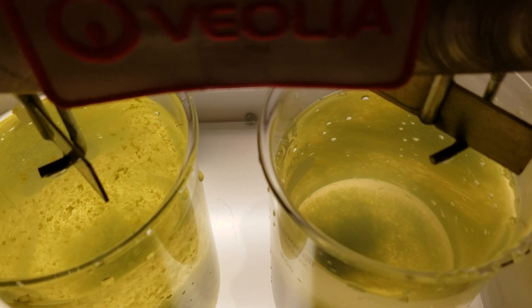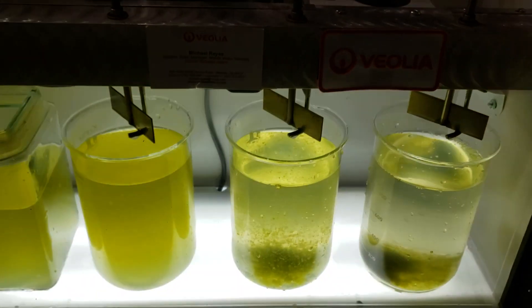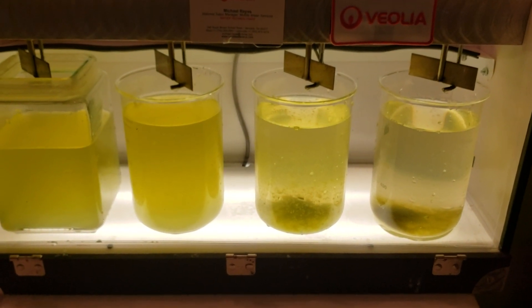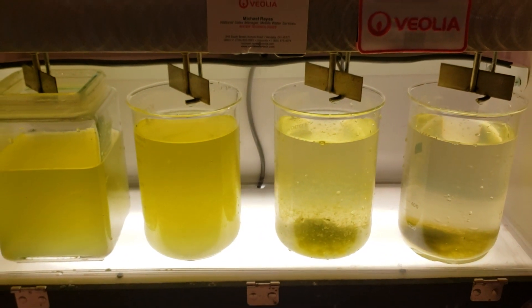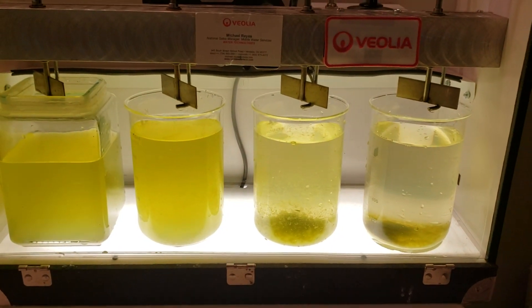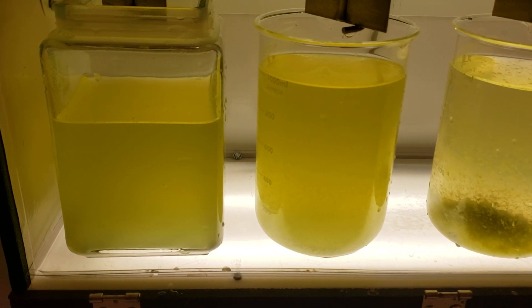Here on the far right we have the ballasted settling — coagulant, flocculant, and the micro sand. We've only been settling for just a little over a minute and you can see we've got pretty complete settling in the active flow jar. The traditional clarifier with flocculant addition will probably take 20 to 30 minutes for complete settling. The far jar on the left really doesn't settle at all.